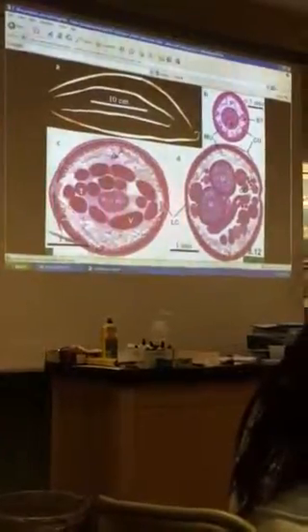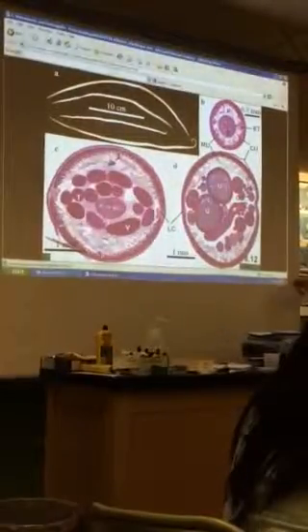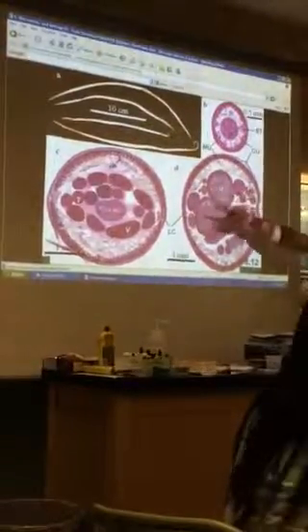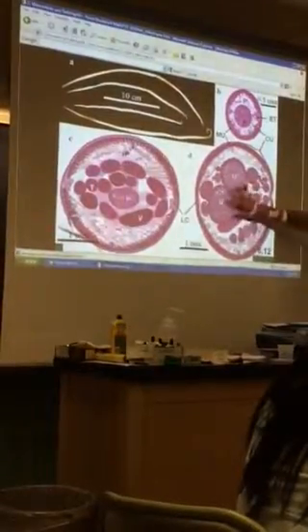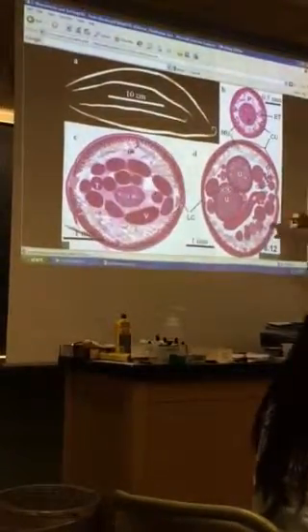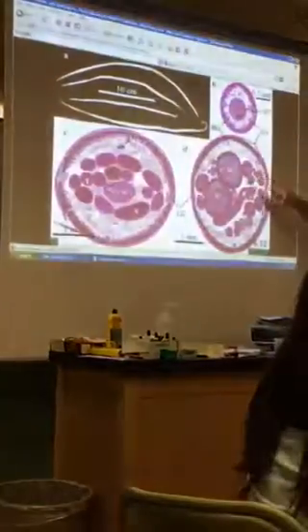And so the biggest spaghetti, the biggest tube, was the uterus. So here are the two uteri on the female, the medium-sized tubing. Since it goes all back and forth like that, there's more than two of them. Right? A lot of times you only have two uteri because they're big, but we'll have a lot of oviduct, and then the smaller circles are ovary.